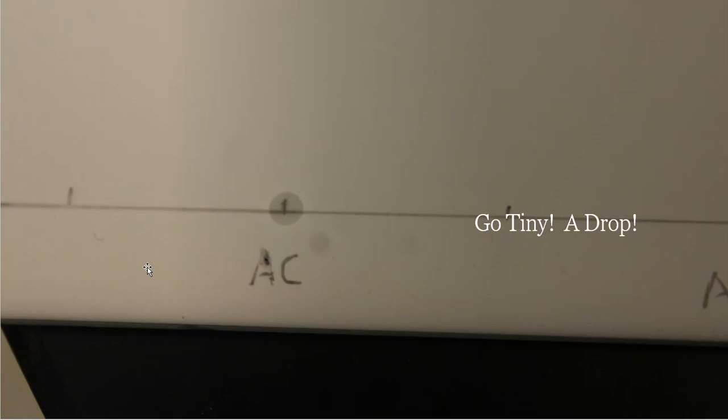How big? This big. That's it, folks. Go tiny. So one little drop, very quick, very fluid motion. You don't want to just hold the capillary tube there. You want to make this a very quick prick. And you should see a spot that forms on your plate that looks like this. And I was very happy with it. Let me tell you why.